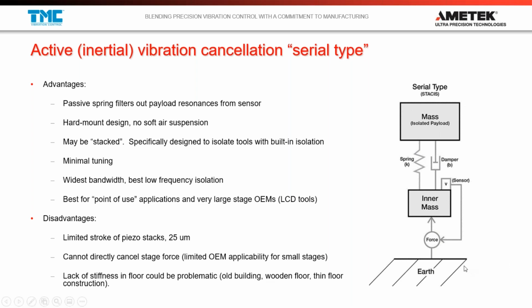So say a floor vibration comes in, and it's going to transmit through our force actuators, and then it's going to hit our sensor before it hits our payload. And then our sensor is going to do what a feedback system does. It's going to try to send back to the actuator an equal and opposite signal and cancel it out.